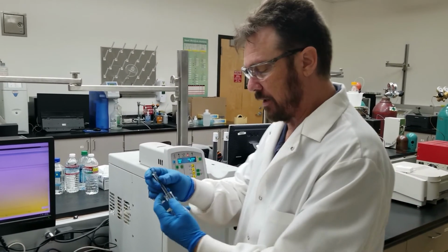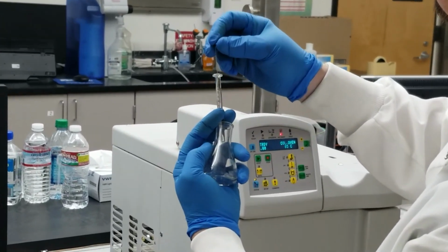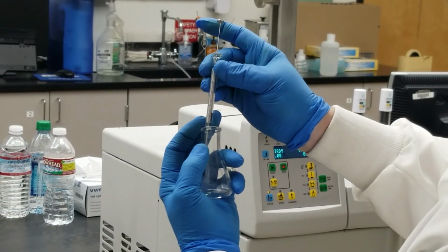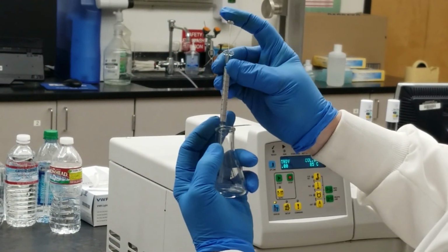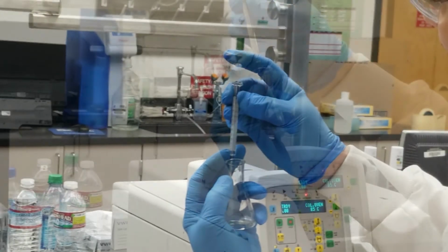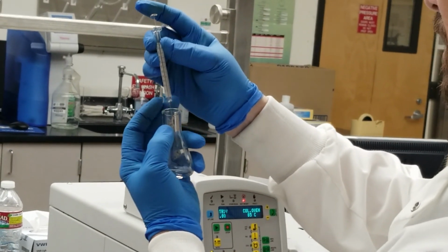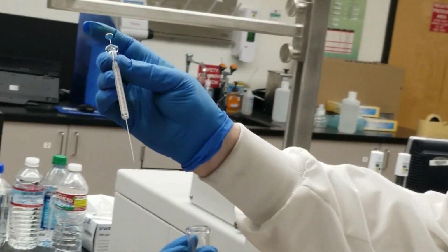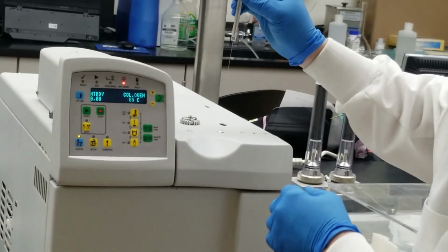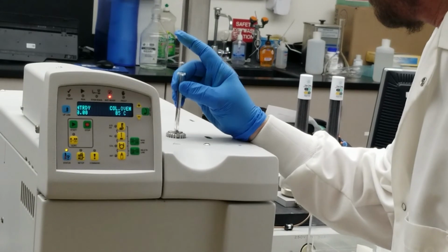I am going to take this and I'm prepping it, so I'm just drawing it up here, making sure. You can see it. It's hard to see through that camera. This is in microliters, and this is a 10 microliter syringe, and I want a 1/10 of a microliter. It's such a minuscule amount. You'd almost think there was nothing there, which is what we want. So I'm going to go in here. Once I push it down, it will activate it, and then I'm going to hit the plunger, and we'll be ready to go. So here it goes through, activate, done, right out.